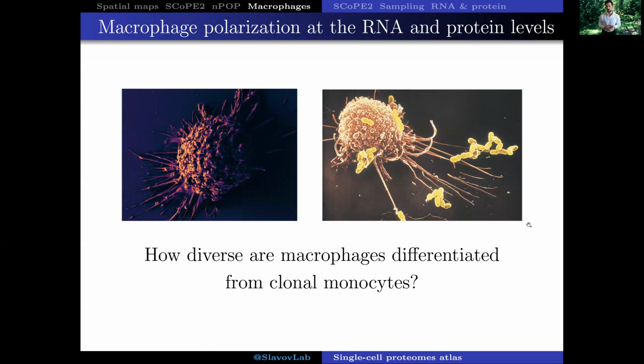Now, to illustrate the capabilities of the single-cell proteomic technologies that we have been using over the last couple of years, I'll introduce this example of analyzing the emergence of heterogeneity in macrophage populations, which is basically motivated by this question: are macrophages differentiated from clonal cells, a cell line, going to be diverse or similar? Macrophages are interesting cells because they have very diverse phenotypes in our tissues and organs.